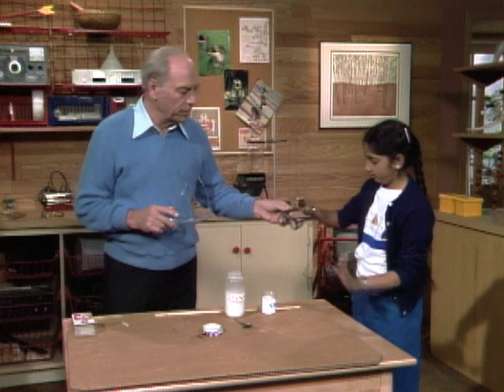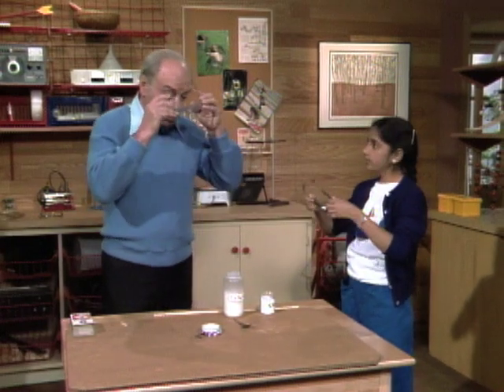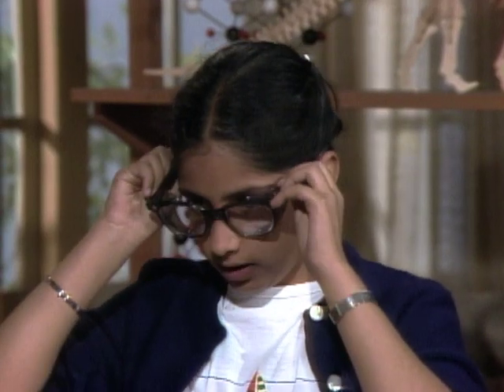Here, Coma, I have a pair of safety glasses for you to put on, because you and I are going to do a somewhat dangerous experiment, so it's a good idea to be prepared.